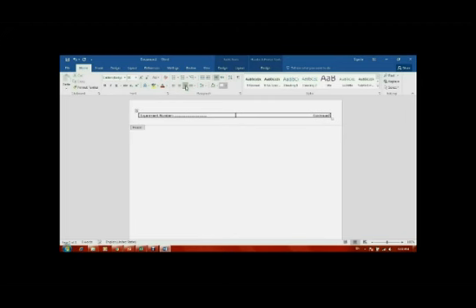Also, as we said, you can prepare this template and keep it for future. Use it in this experiment and all upcoming experiments.